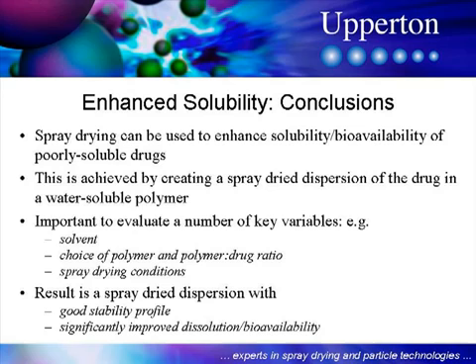For example, the choice of solvent, the choice of polymer, the polymer to drug ratio, and also the spray drying conditions that you use. The result of these studies should be a spray-dried dispersion of your drug which has both a good stability profile and ultimately a significantly improved dissolution and bioavailability profile.